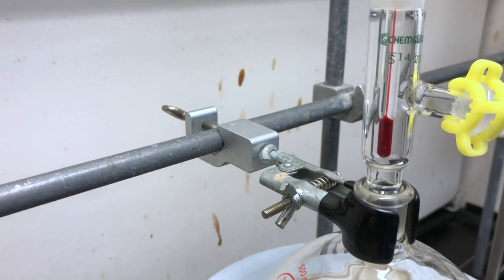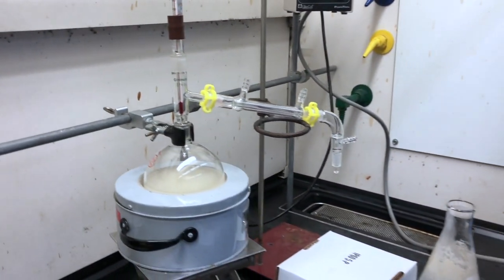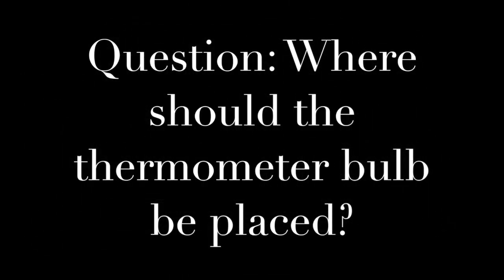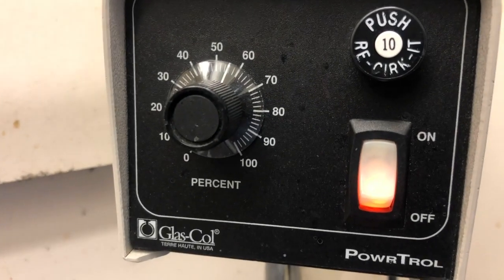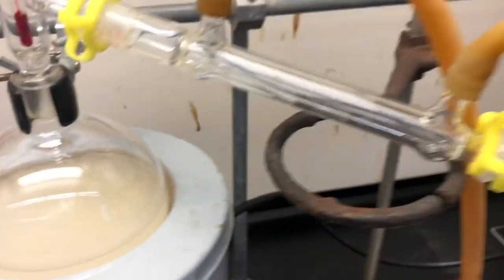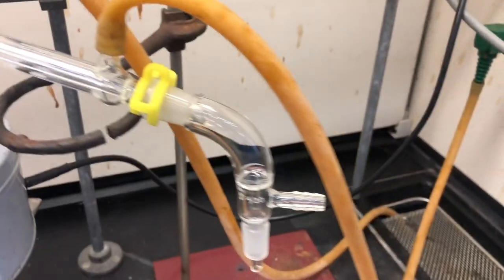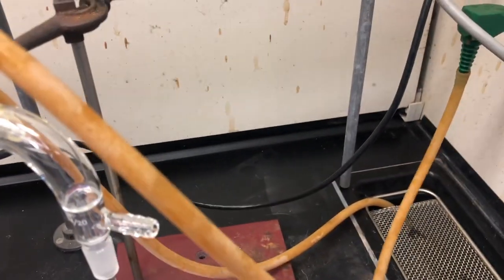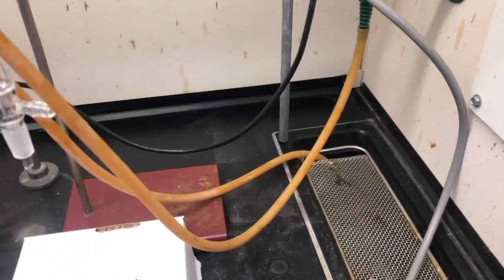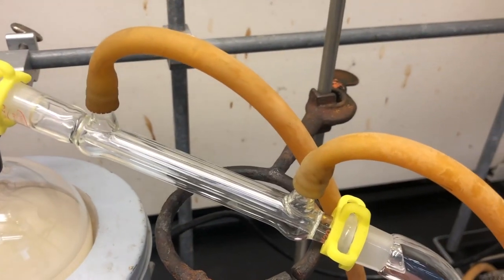We then place the thermometer so that it will read the temperature of the vapors that are entering the condenser. We begin heating at a fairly high rate, around 50 to 60 percent. We also attached our water hoses, the lower one going to the water inlet, and the upper one going to the drain in the sink. You can see the iron ring supporting the condenser.